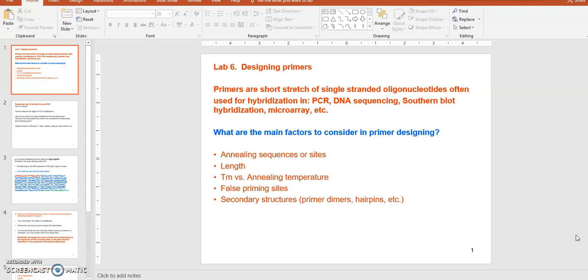So that's why you need to use a high primer binding temperature. The reason is to eliminate random binding conditions, so that only the correct binding takes place between your primer and the DNA, the matching binding, like 100% matching binding. So that's why you need to know what the melting temperature is and provide the primer binding temperature at about 5 degrees lower than the melting temperature. That's the temperature you're going to use as your primer binding temperature, okay?